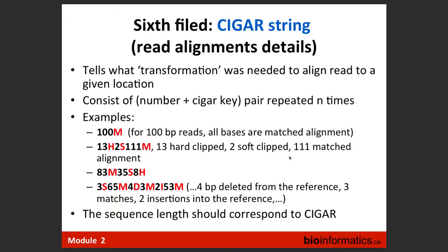Two bases were soft clipped, so they were left in the read sequence, but they were not really used in the alignment. And then there were this many matches, or 83 matches, then 35 soft clip, 8 hard clip, and then there is D for deletions and I for insertions, etc.